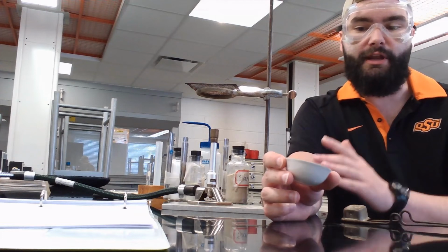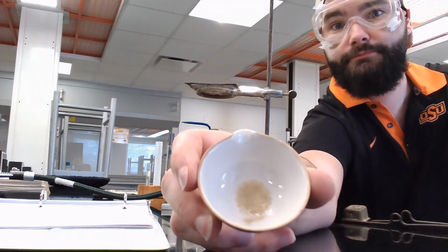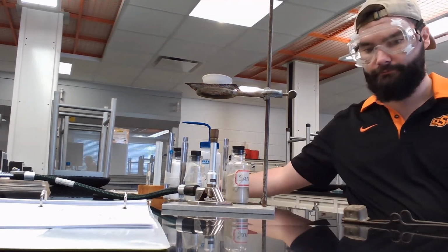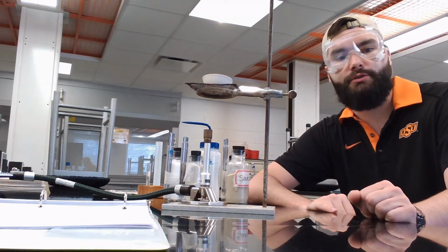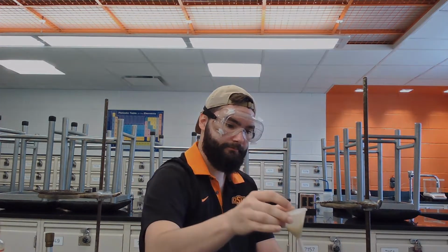Alright, so now I have pipetted off all of my excess water, and I will now dry this out with a Bunsen burner. So my sand is already dry, I've already killed the Bunsen burner. Now we're just waiting on the water to continue filtering. My salt water and silt are done filtering now, so I can go ahead, remove my filter.